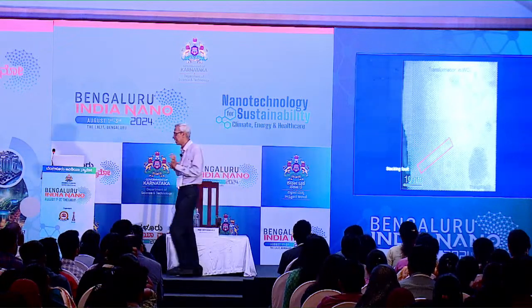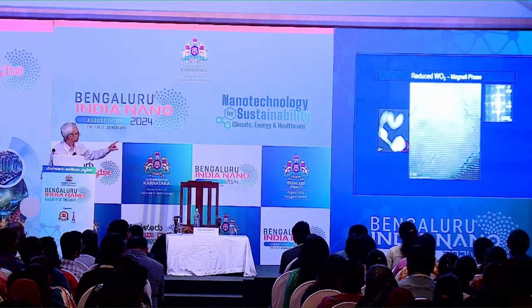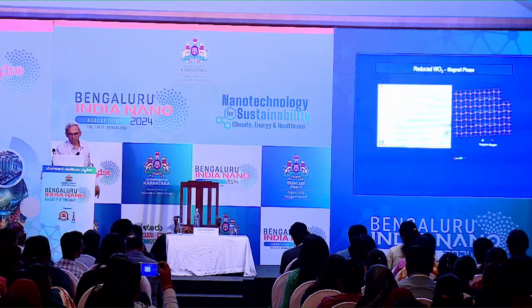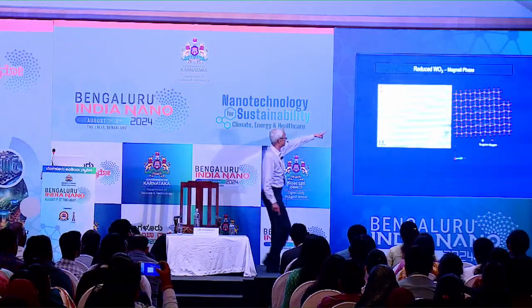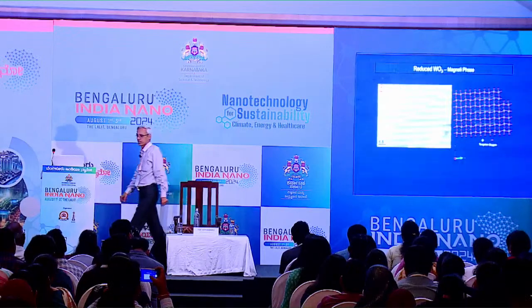This is a tungsten oxide material, and more interestingly, you can look at some kind of defects. You can see all these linear defects in this thing, right? You can actually characterize them. What you are basically seeing here, you can see a discontinuity in these atoms. That is what is called a crystallographic shear structure.